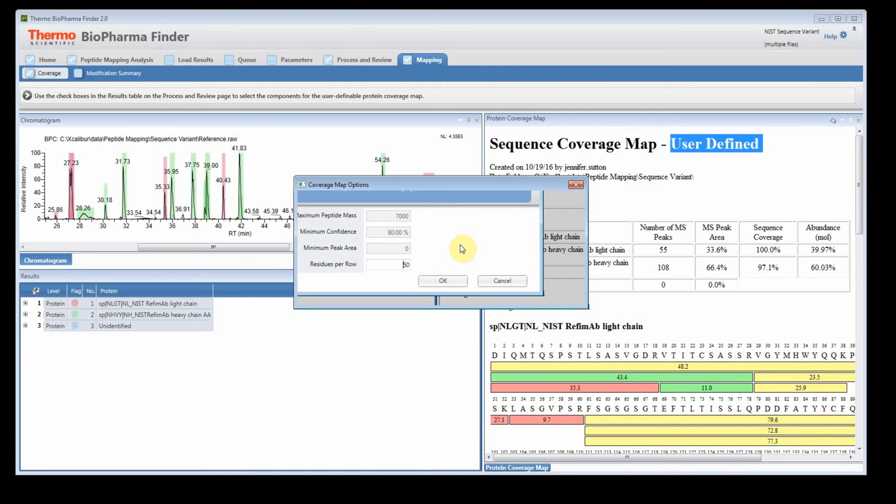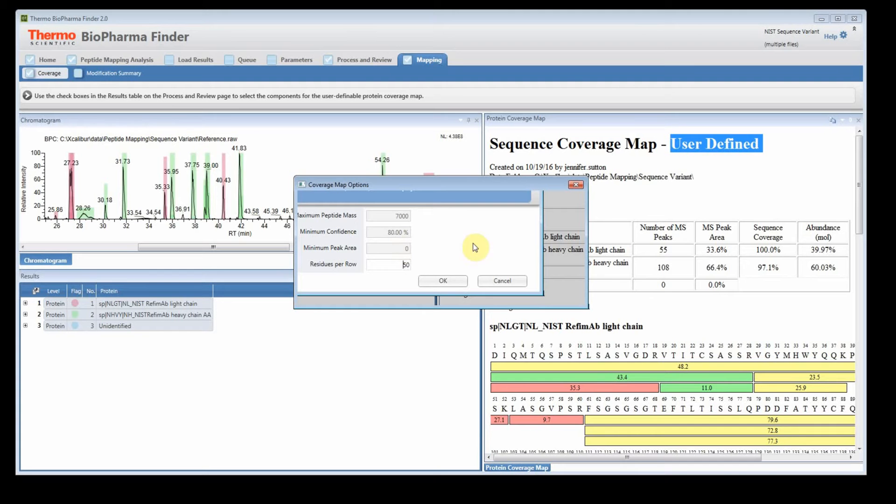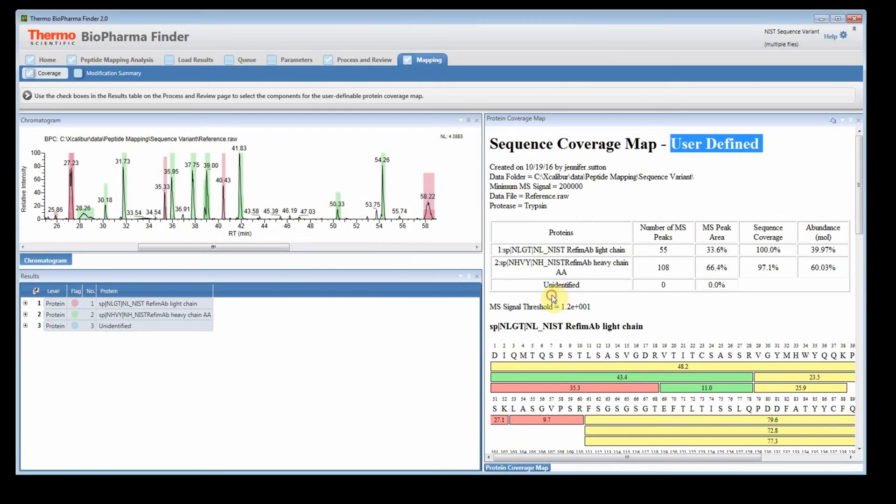The other thing that happens when you do this is you're overriding these parameters. So there are default parameters that are used for the peptide coverage map. And when you tell it, when you check it and use the user defined, you're overriding these. Now the most important one that you're overriding in this case, which is probably why we got better coverage, is the minimum confidence score. So the default has the minimum confidence score set to 80%.